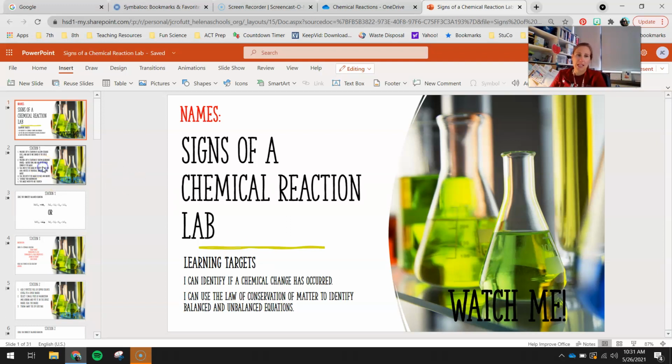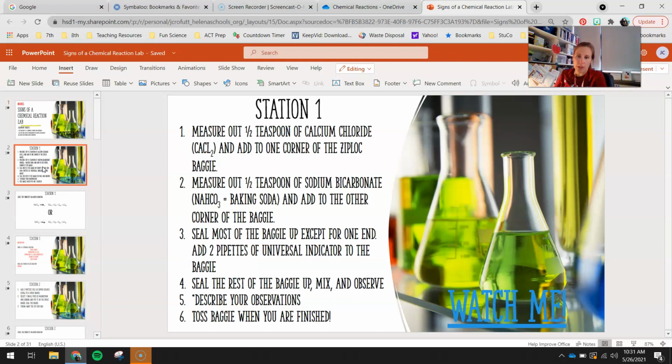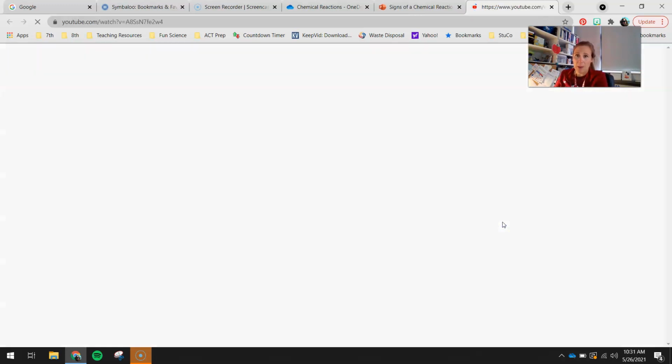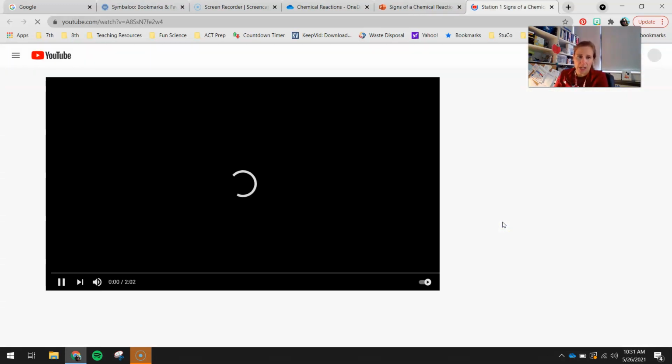Okay, so let's go ahead and take station 1, for example. You guys will see the directions that the kids in class go through and the directions basically that I go through in the videos. But the main thing that you guys will need to see at home is this little video down in the bottom right-hand corner. There will be one on every direction page for each of the 10 stations. So you'll right-click that and open it up. And I'll just show you one example of what these might look like.